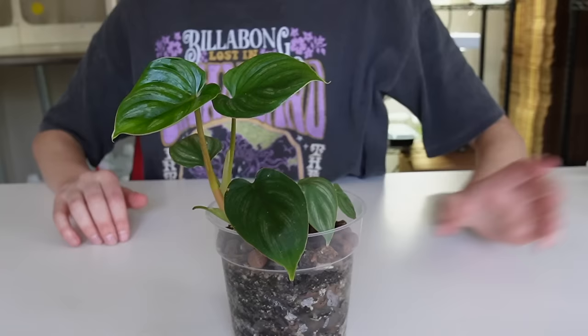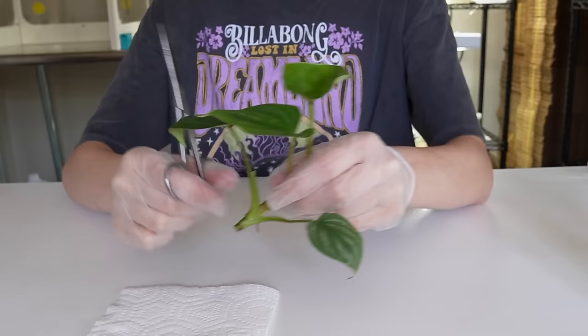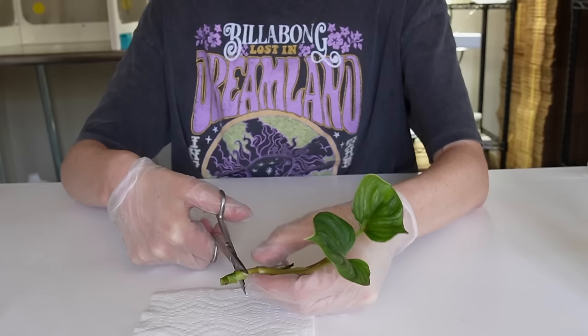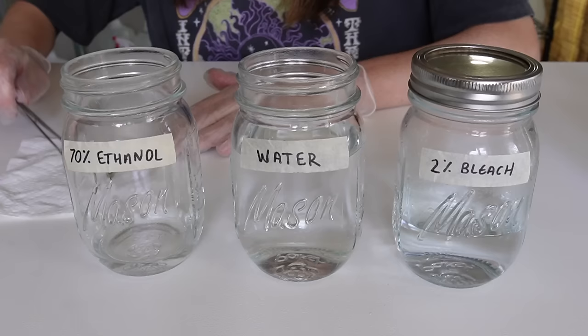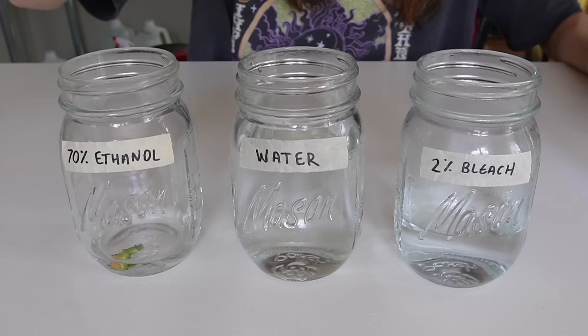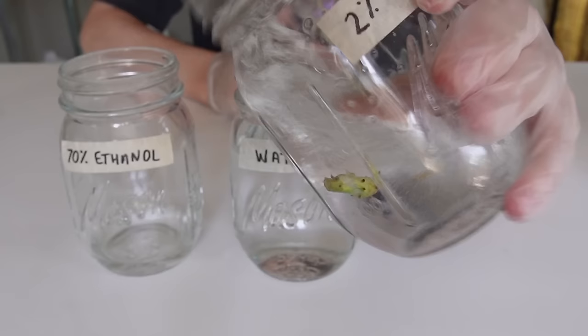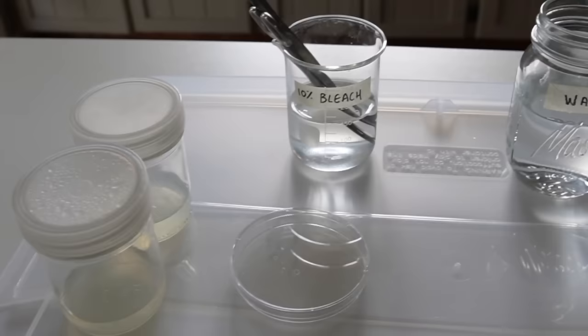We're going to select the plant to tissue culture — in this case a philodendron mame. According to the protocol, we want to use nodal sections as explants, so I cut a few different nodal sections and spray the scissors with 10% bleach between cuts. Outside of the still air box, I rinse the explants under tap water for 15 minutes, then place them into 70% ethanol alcohol for one minute. Then they get rinsed in water and transferred into a solution of 2% bleach and 98% distilled water, agitating by hand.